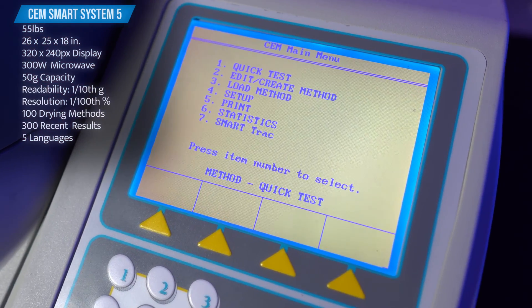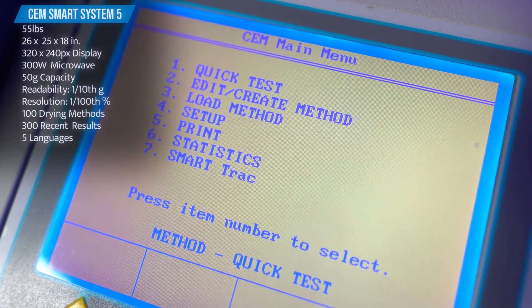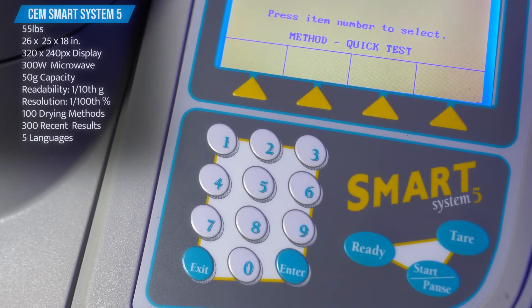There's a black and white backlit display with a resolution of 320 by 240 pixels, a physical number pad, as well as the most useful buttons such as start, stop, and tear.